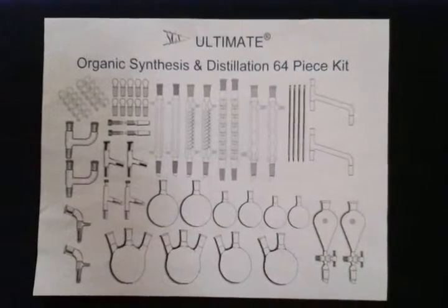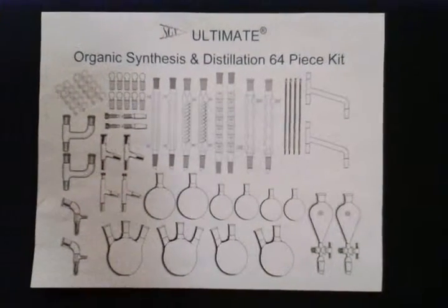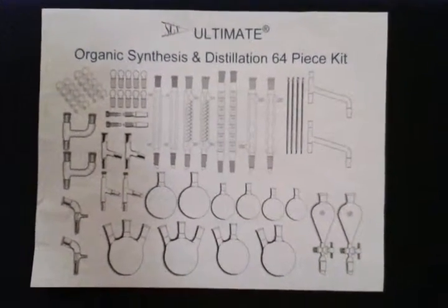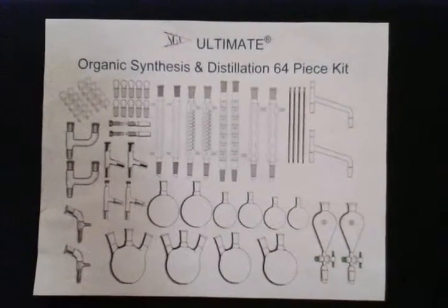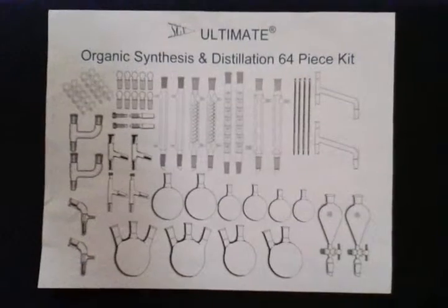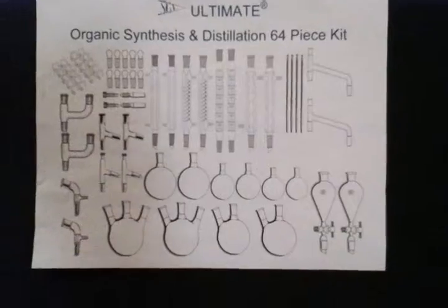We are very pleased to offer this Ultimate Series Organic Chemistry Lab Glassware Kit for organic synthesis, distillation, separation, and other organic chemistry preparations. All glassware in this kit is made from low-expansion borosilicate glass, and all joints are 24/40. This kit comes complete with the following.